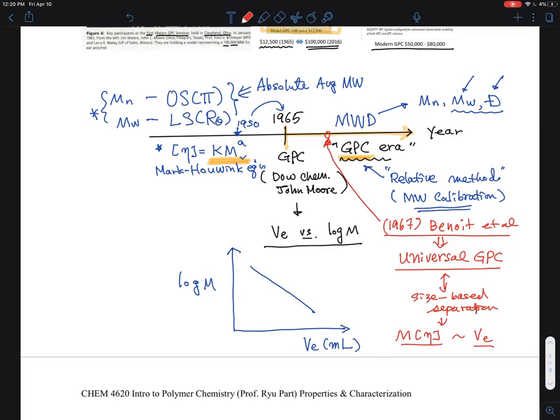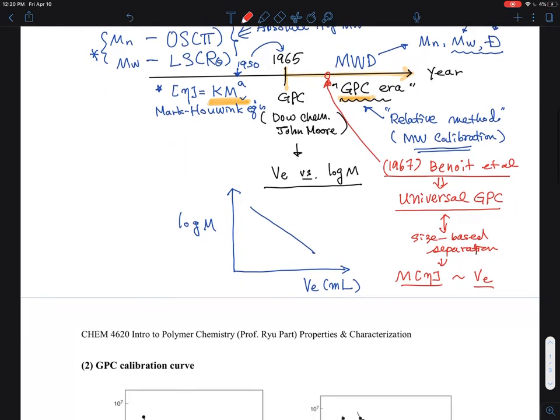And so therefore this gets the name of what is now called size exclusion chromatography of a macromolecule. It's called SEC, and it justifies this. You separate things based on size exclusion, and size is a very important term.